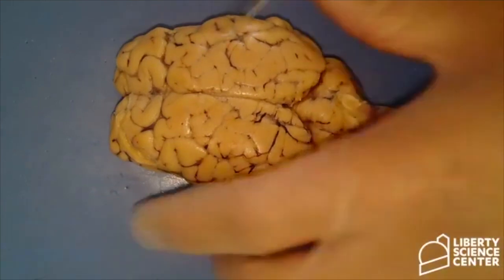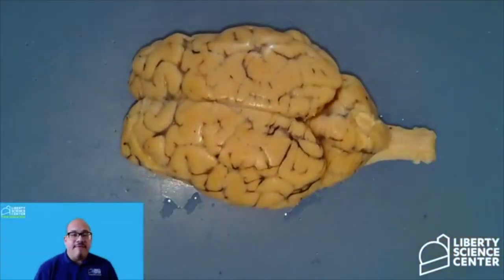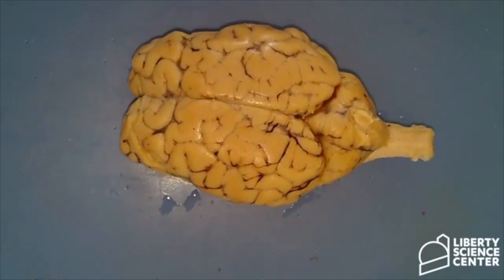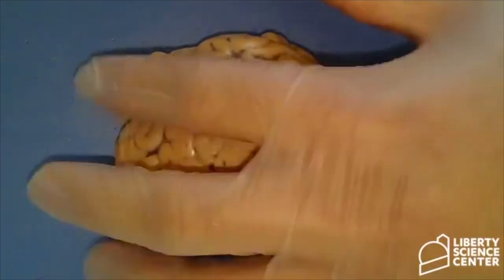Just to give you an idea, the frontal lobe for the sheep is very small compared to humans. Humans have a very large frontal lobe. That doesn't mean a small frontal lobe makes the sheep unintelligent. The larger the frontal lobe found in an organism, it is a small indicator that they have the ability to plan and make those executive decisions. In fact, for humans, it accounts for 25% of the brain volume in our heads. So that is the frontal lobe.